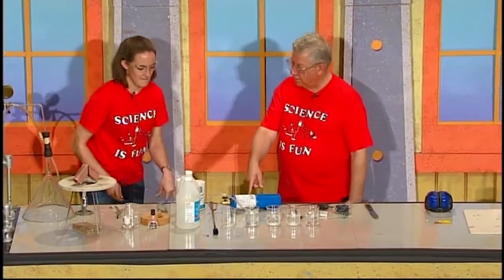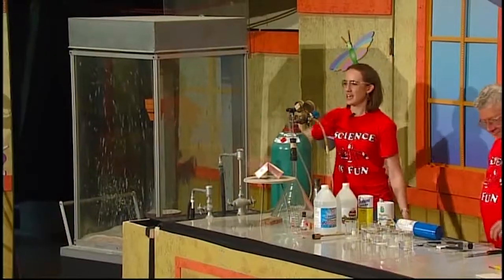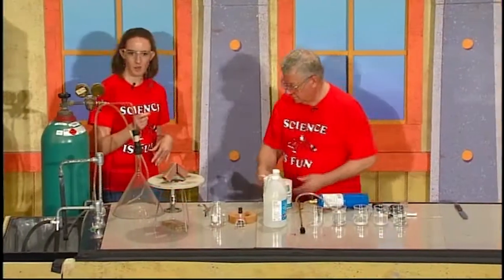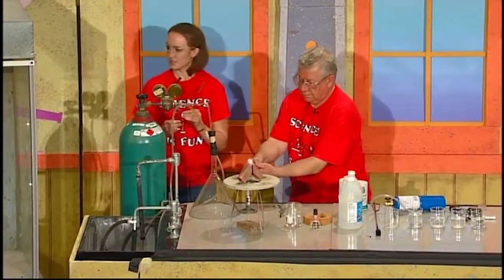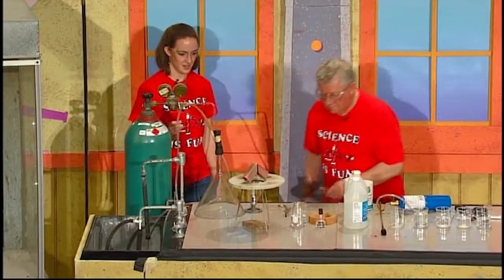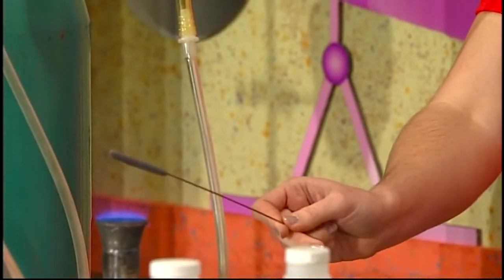What are you going to do with the experiment here or someplace else? Well, so we have a second set of flower pots in here. We want to use this case because it's a little safer. And to get the reaction going, it needs a little bit of a spark. So I have a wand. And we're going to use the burner to light my wand. All right. Get the burner going.